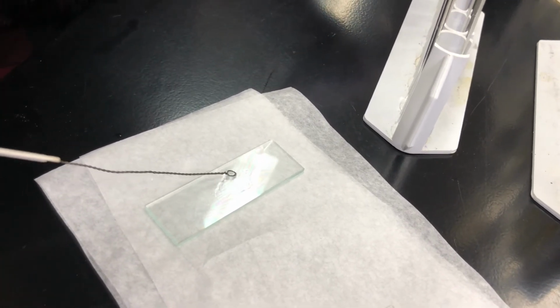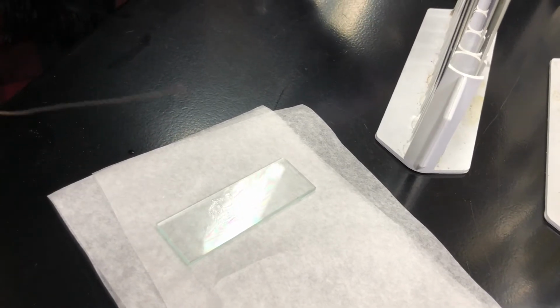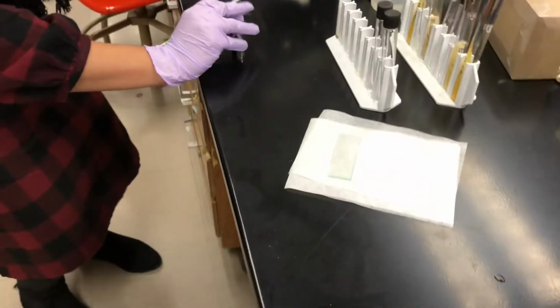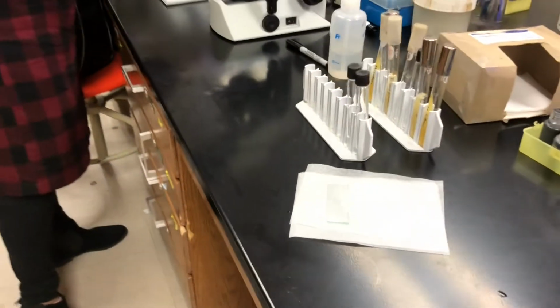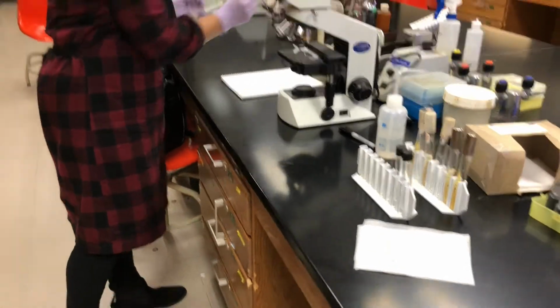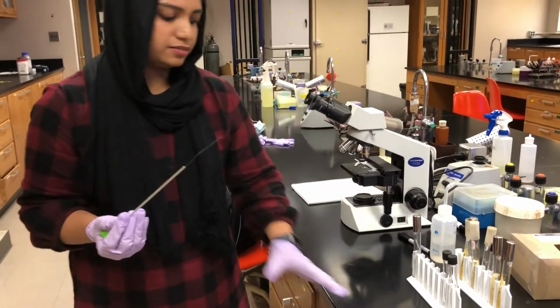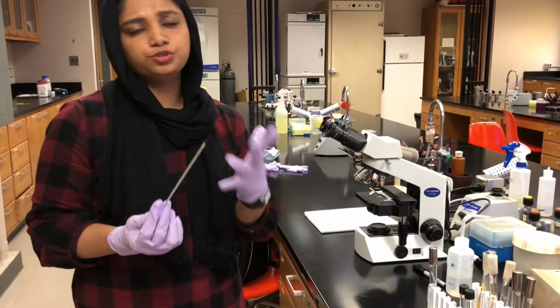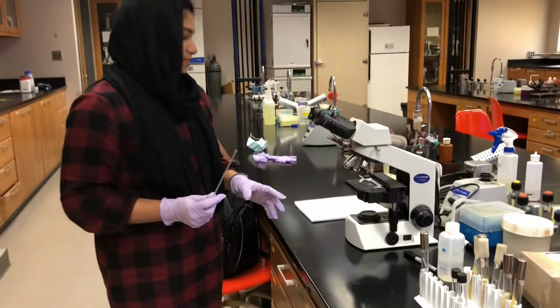I'm spreading it as thin as possible, which will help it to air dry faster. Okay, and again incinerating my loop. So I'm going to wait for like 2 to 5 minutes to get it air dried. Then I'm going to heat fix this.